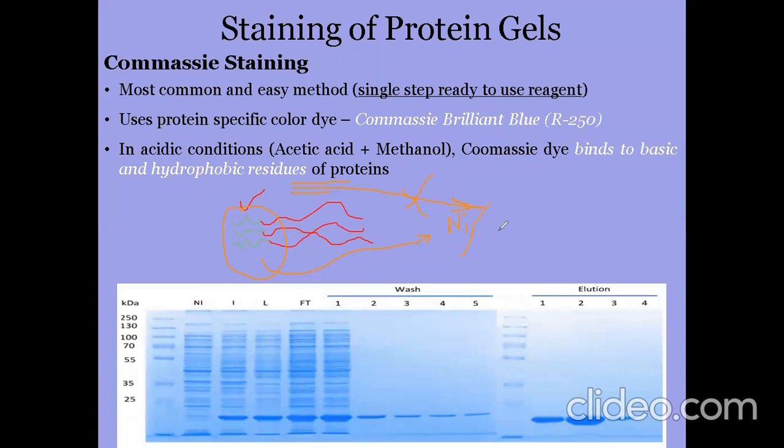We need to separate those proteins. Now they have been separated from the nickel, and that has been eluted out. So this band and this band have been eluted out, and we get a specific band rather than these ones. समझ आ रही है?